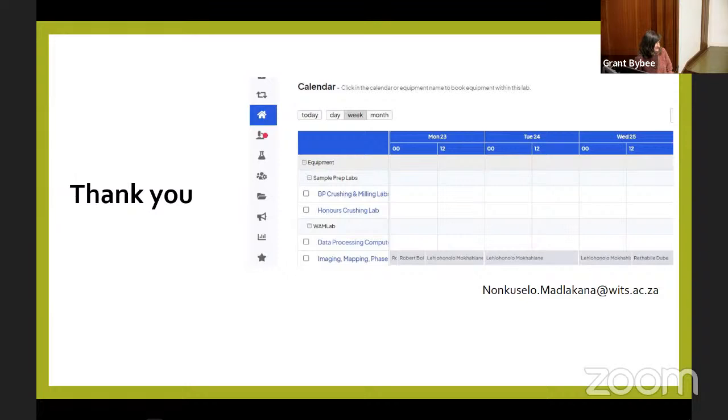So could you extract those intermediary libraries to analyze offline if you wanted to? Yes, offline, and you can also import data from XRF, ICP-MS, as well as microprobe analysis, and then try to compare. There again, it's important to make sure of sample representativity, because if we are doing XRF and you have one block randomly and one thing to match, unfortunately they won't match. You have to plan things in advance. If I want to compare, then do the sample collection accordingly.